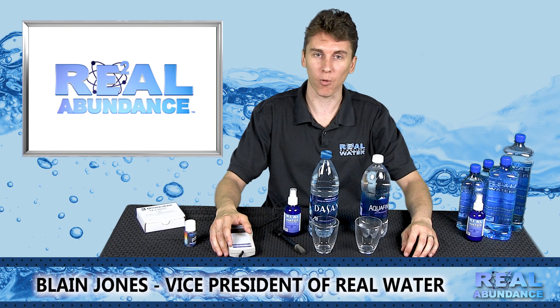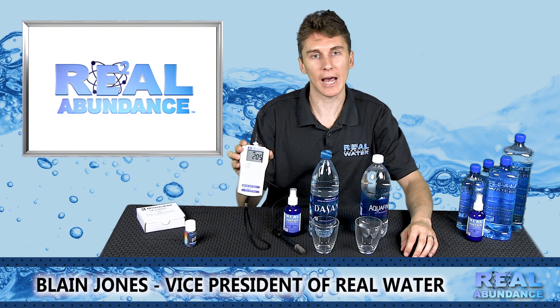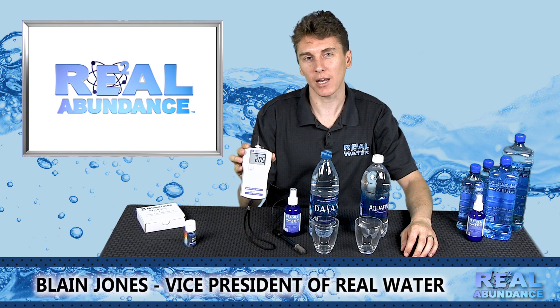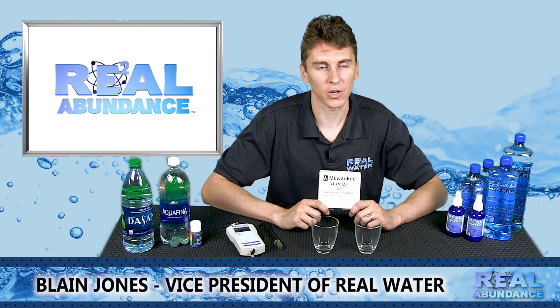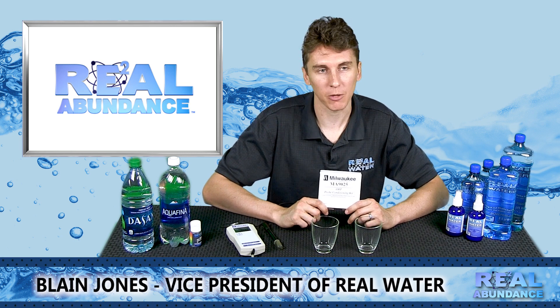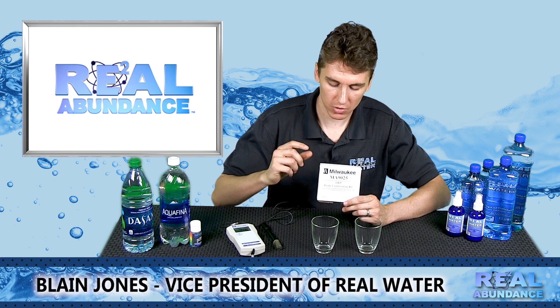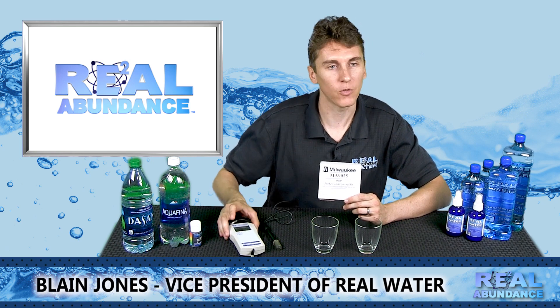The first thing that is very important is that your ORP Meter is properly calibrated, and I would like to show you how to properly calibrate it. If your ORP Meter is not reading negative values well or is giving you inconsistent readings, that means it needs to be properly calibrated. You do that by using calibration solutions that come from the manufacturer of the ORP Meter itself.